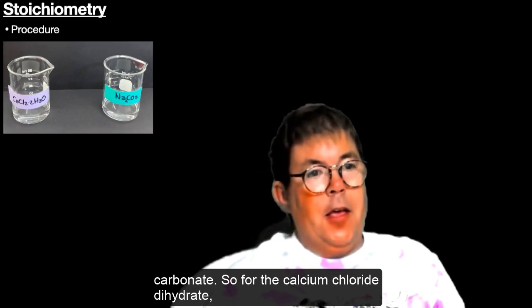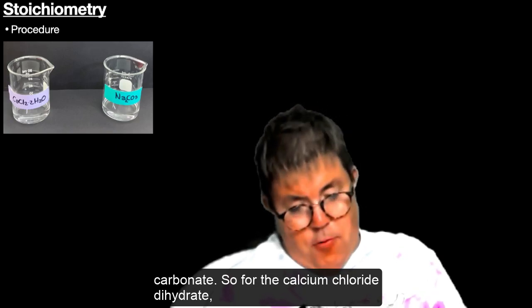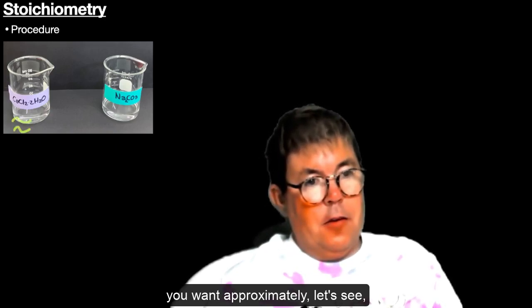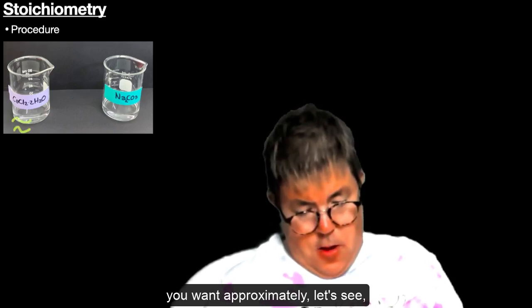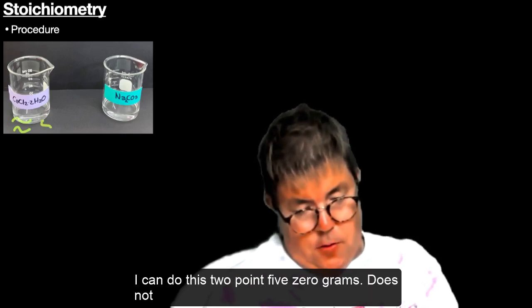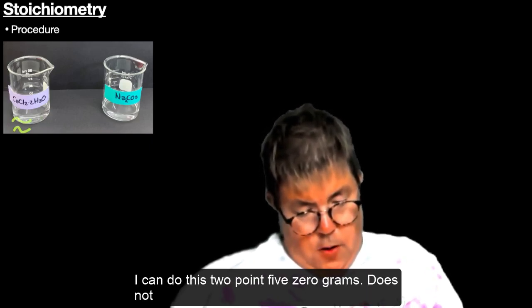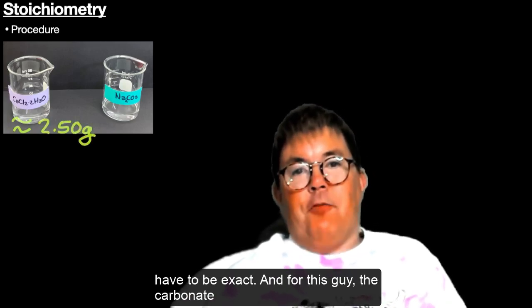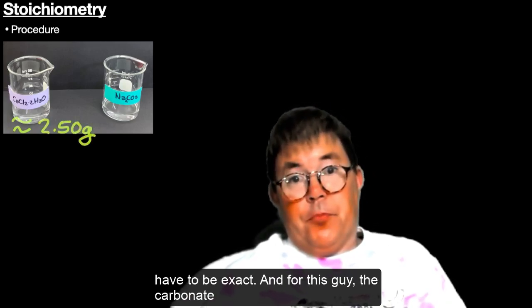For the calcium chloride dihydrate, you want approximately 2.50 grams. It does not have to be exact.